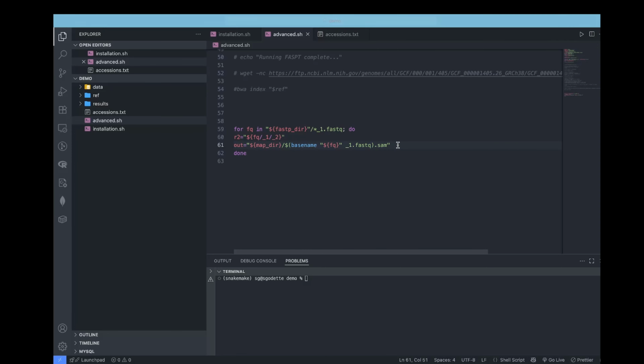We can now then finally write the BWA-MEM logic, which is just bwa mem, and then put the number of threads that you want depending on your compute resources. In my case, I will just put 8. If you have more, you can include. And point the program to the reference file. And now you can just put your read1 and the read2s like that. And then we want to redirect everything to the output, which is the sam file that we created earlier. As simple as that. So our program is barely complete.